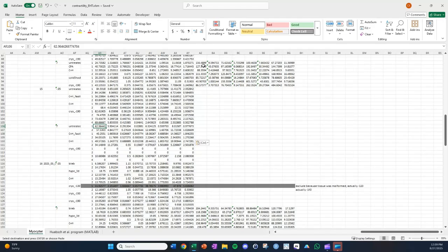And then I'll go in here and calculate the percent change over time. So I'll just paste this formula over. And what this formula does is that it'll calculate the change between this condition before and after. So the beats per minute went down. So this is 74% of the initial. So 62 divided by 84 is 74.5-ish. And then the standard deviation here, I like to just include all the information, is plus or minus 7%. Drag that over, drag it down to get all of it.